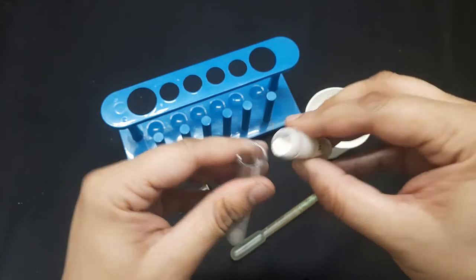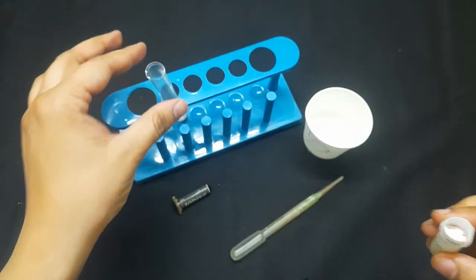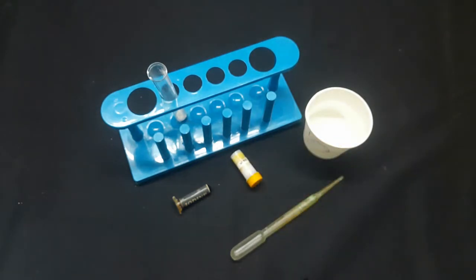Both this iodine and starch powder are not dangerous, but you should never taste any chemical. So you have to use all the chemicals very carefully.